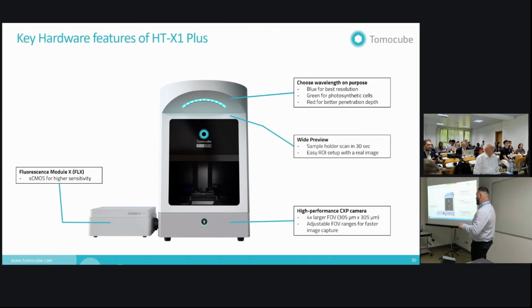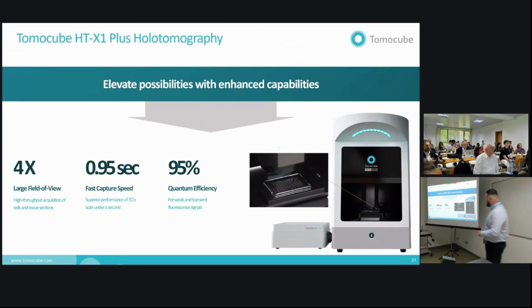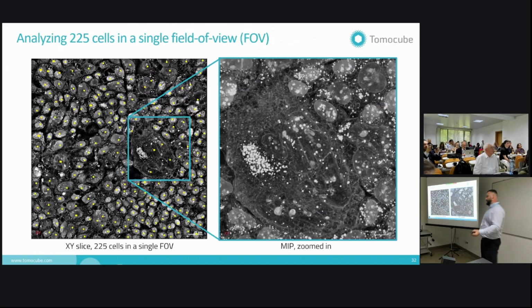So you have one camera for the fluorescence, one camera for the holotomography, and overlay the two. Now you don't have to use too much intensity of the LEDs in the fluorescence, or long exposure times. Which means we can go below a second if you do a smaller volume with this camera, and that means a bigger field of view, more cells in a single field of view, better for analysis in this case.